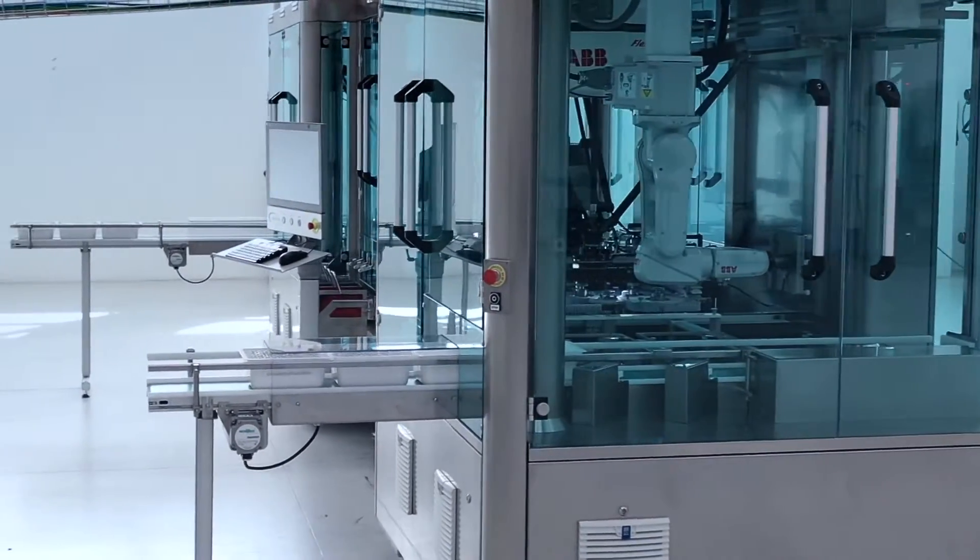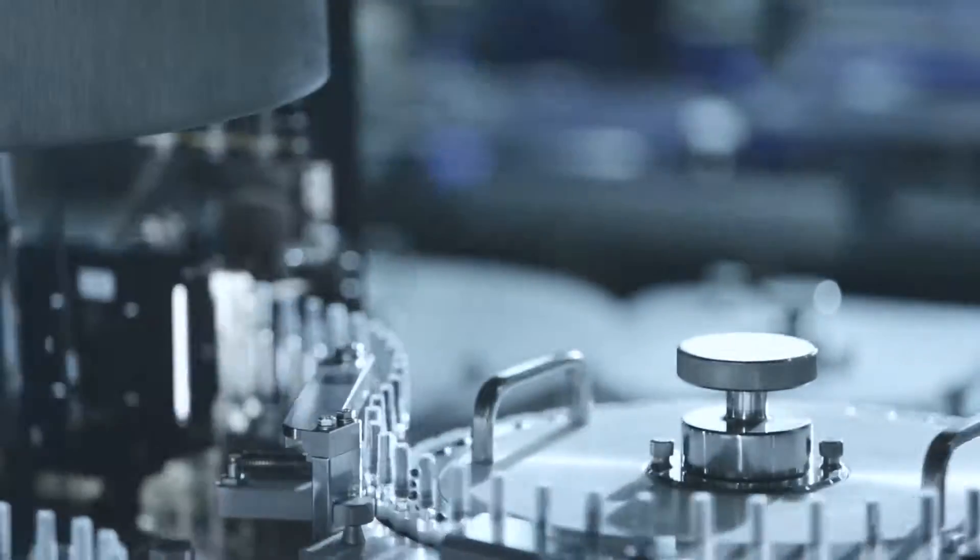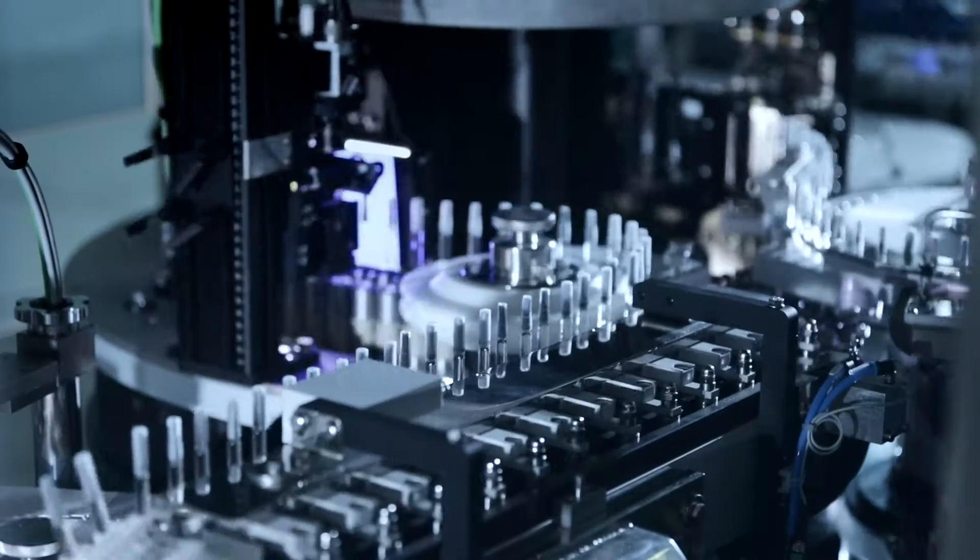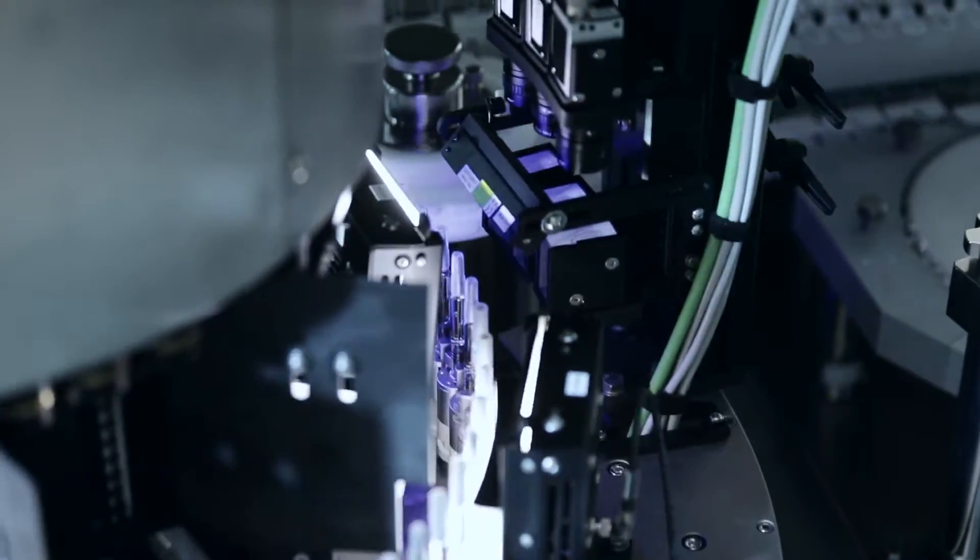The entire Breveti K15DR solution is conceived to assure smooth mechanical handling during the whole process, preventing any possible friction between syringes and machine components.